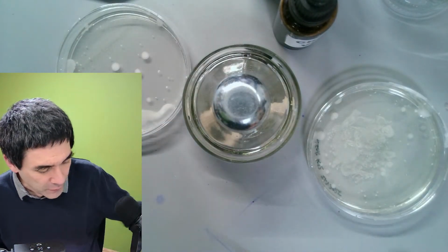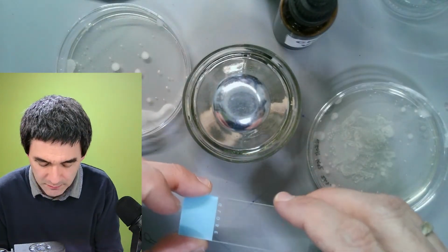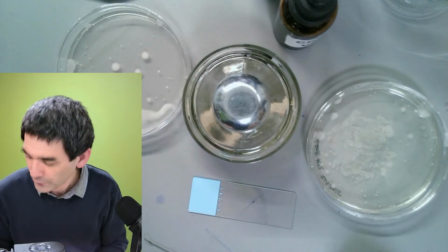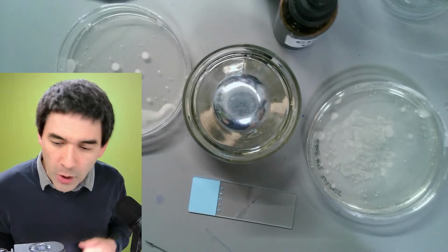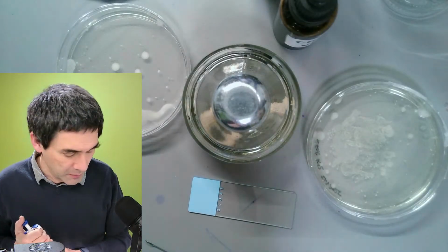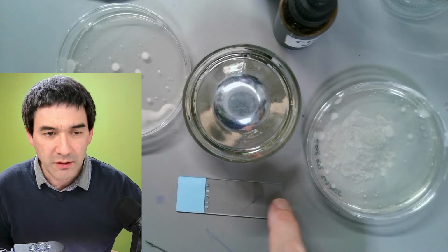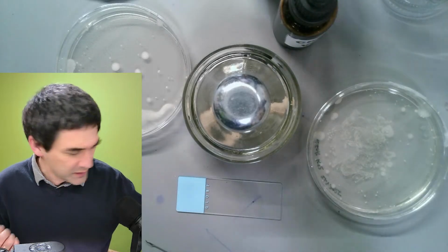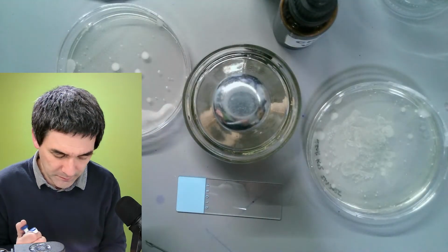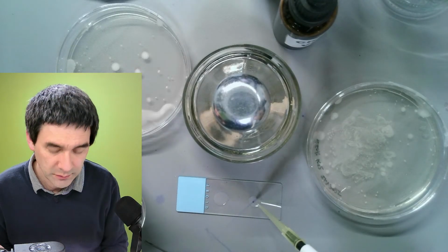So what I'm going to be doing is the following. Number one, I'll be preparing a microscope slide over here. First of all, I'm going to put a small drop of water on here. Theoretically, I could actually put both samples here. Yeah, maybe let's do that. Let's just put two different ones over here. So a little bit of water here, a little bit of water over here.